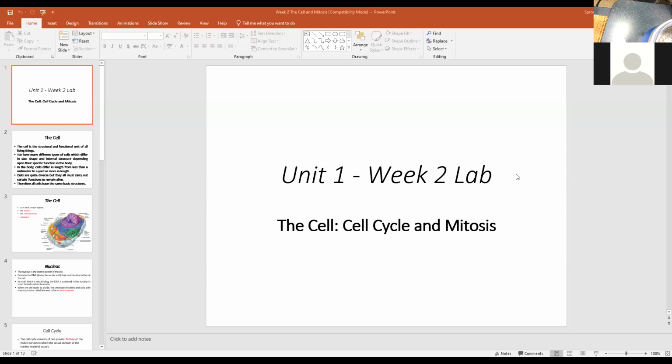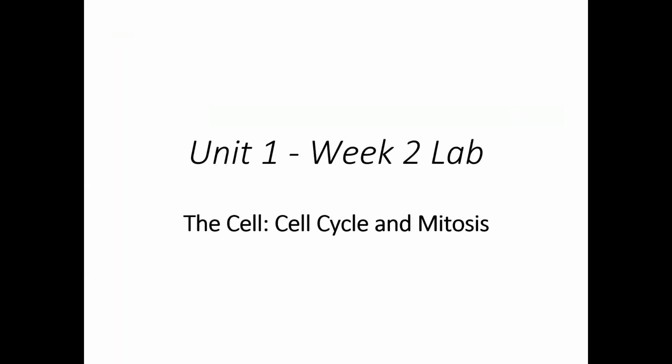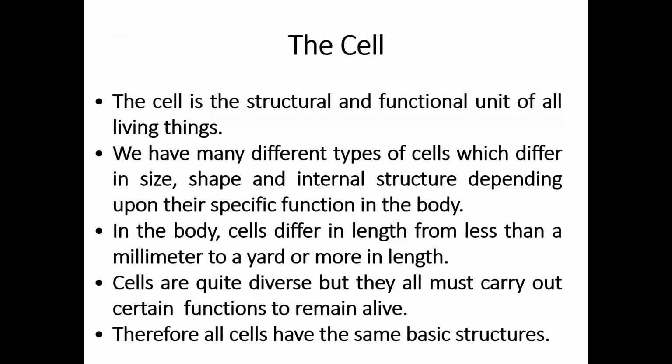Everybody that's online should see the slide that says cell cycle and mitosis, and that's where I'm going to open up on. And remind me before we're done to show you where the study guides are for the lab test for next week. It's in the content section of eLearn, but I want to show it to you and walk you through it. So, okay, we're going to take a look at the cell cycle and mitosis.